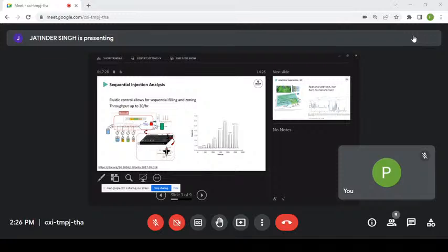And you can see here that we've got a couple of different vials that contain our sample and our different reagents in the carriers. We've got valves here that allow us to direct the liquid. And by controlling these valves, we can inject one thing after another, pretty much like a train.